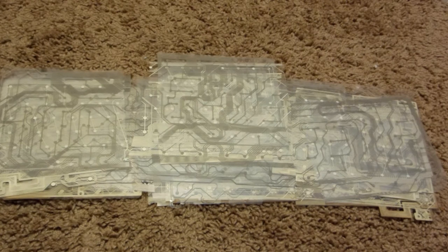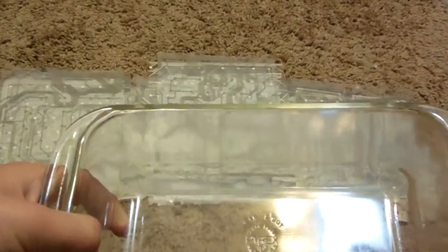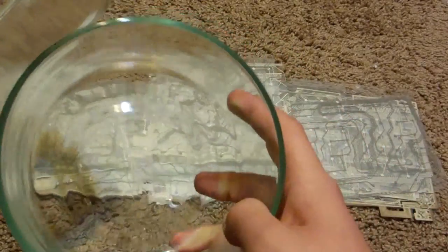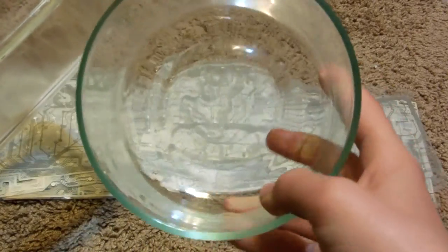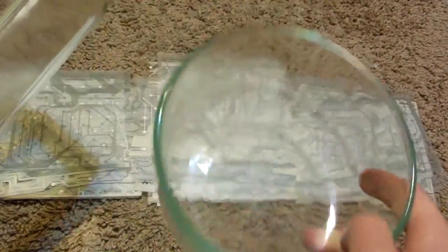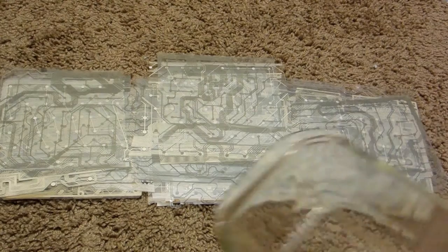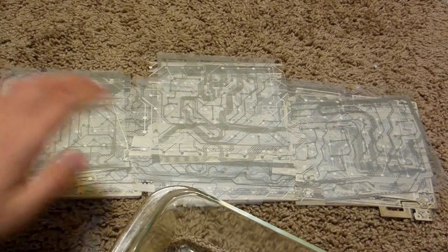If you don't have any access to good science equipment to hold your mylars when you dissolve them in a nitric acid bath, you'll probably need to do some shopping, as it's not a good idea to use any container that has come in contact with chemicals in your cooking. I got those from Goodwill. This one was only $1.99, and this other piece on the right, which is quite similar to a crystallization dish, which is very expensive, I got for about $5.99. So it's a little expensive, but much better than having to buy a whole set of Pyrex when you're not able to use some of it, as it's not suitable.